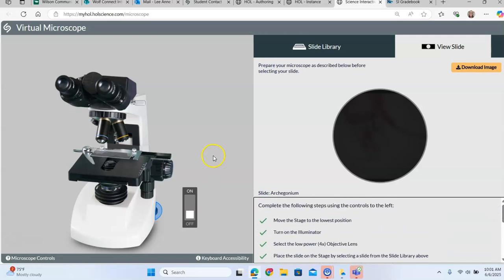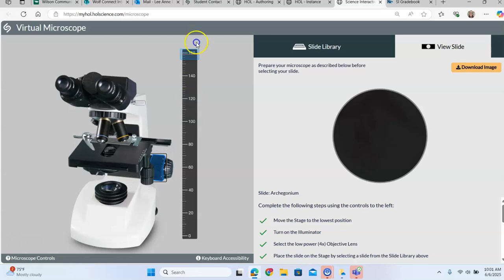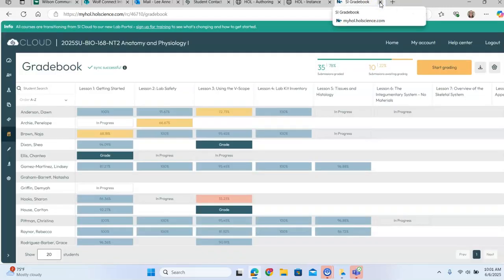Oh, goodness. And the slide, let's put it at a higher position and just see. Let's put it all the way up to the top. All right, that's not going to work. So what if I just get out of it and then try again? All right.